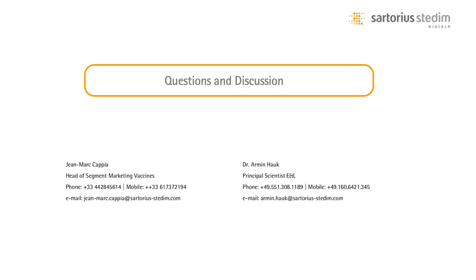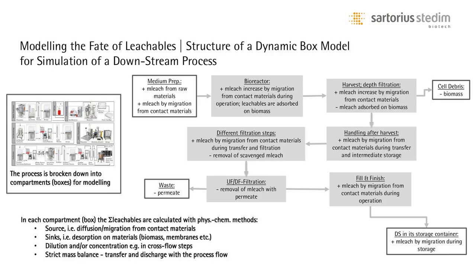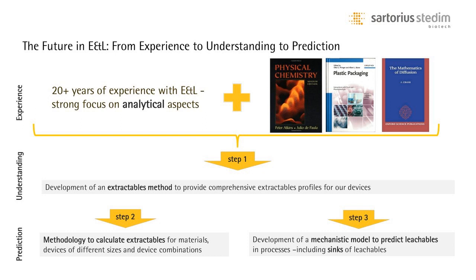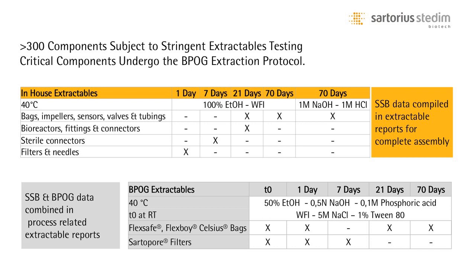What is the defined time frame for short-term and long-term exposures to be considered in the diffusion and partition model? Yeah, as I already said, for filters we normally use short contact times, as everybody else. USP 665 assumes short contact time. BioProcess requires short contact time. We also use short contact times, and for materials which are used for longer contact time, of course we have kinetic data. That means we know when these systems are running into equilibrium. And that means, for example, for a bag material, short contact time means some hours and days, and long contact time means, for example, 1 month. So this is approximately the time frame we are talking about.